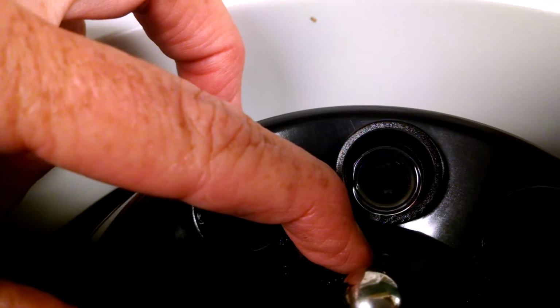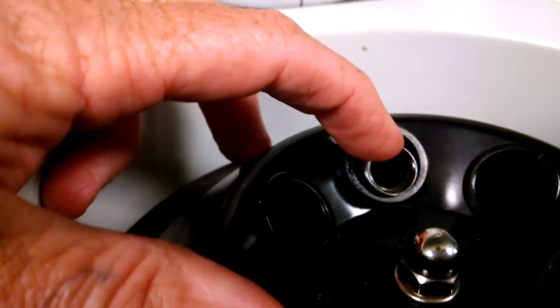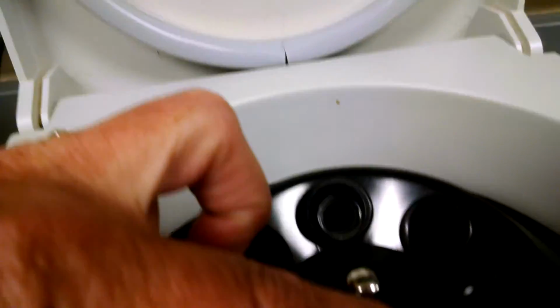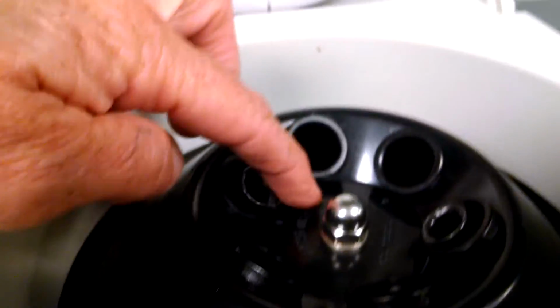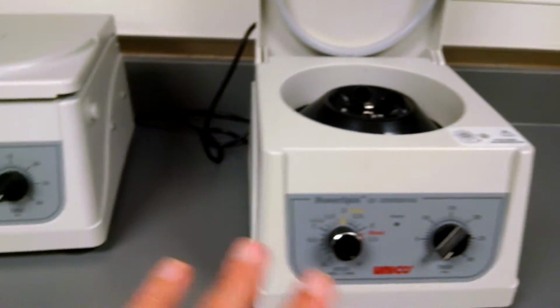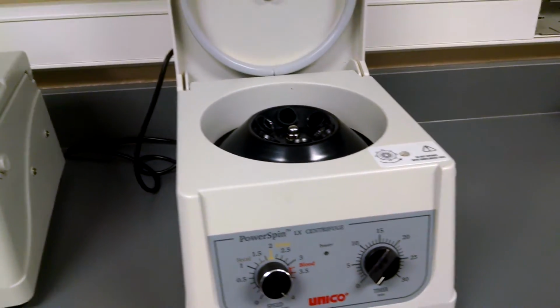You can't really see it very well here, but there is a number 4 by this one, and there's a number, what is that? It's very hard to see. A number 1 by that one. So 1 and 4 are opposite, 6 and 3 are opposite, I think, and 2 and 5. So you'll want to look and see what number your test tube is by and whether you have it in the right centrifuge or the left centrifuge so that you know that you get your right one back.